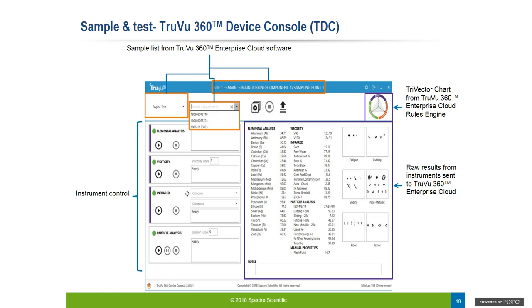And so in that way, you have an opportunity then to just go back, select another of the samples from the drop-down list, continue testing, et cetera, because right here on the console itself, you can access the entire sample list for the day, run your samples. If they look good, just upload them, and then just keep on running your samples.